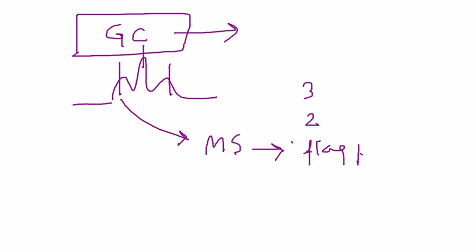And if you are able to determine the molecular ion, which matches the molecular ion of your product, you can tell which of the 3 peaks is the pertinent peak that you should go after and purify and determine to be your product. So GCMS is actually a very, very important tool in identifying the particular component of interest for a certain reaction.